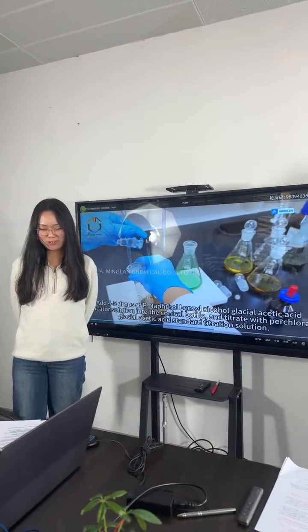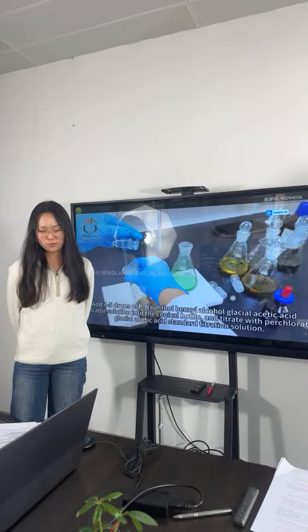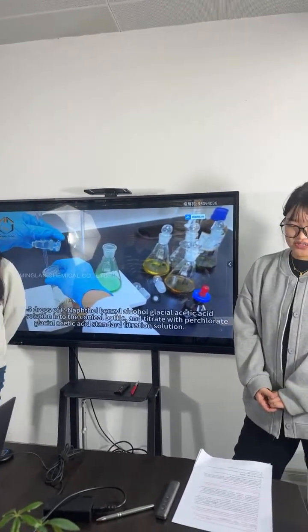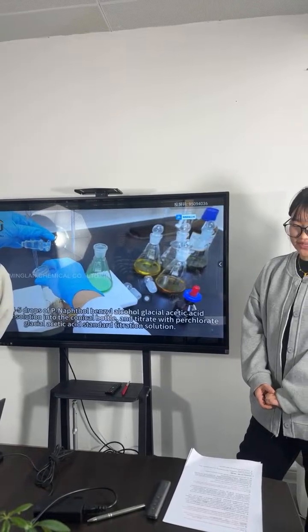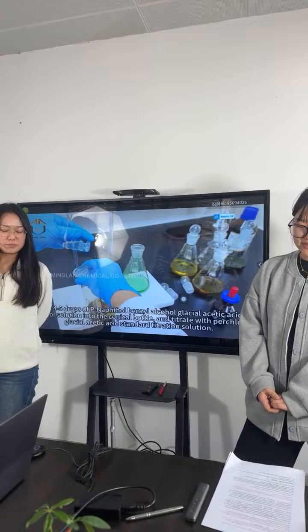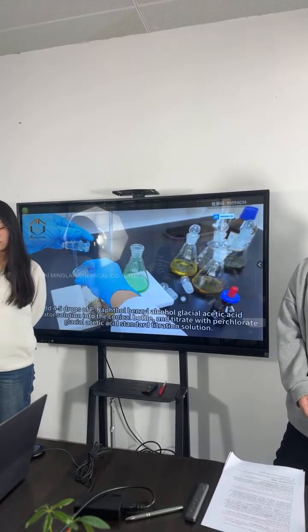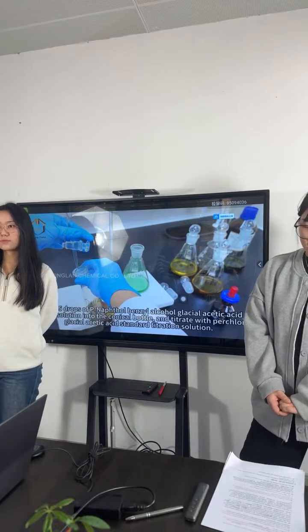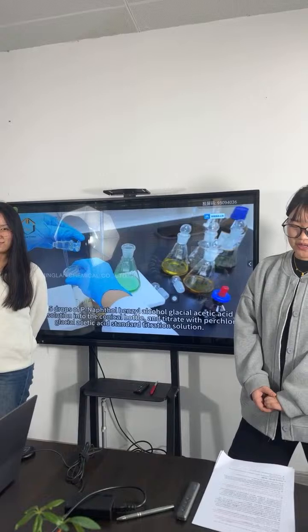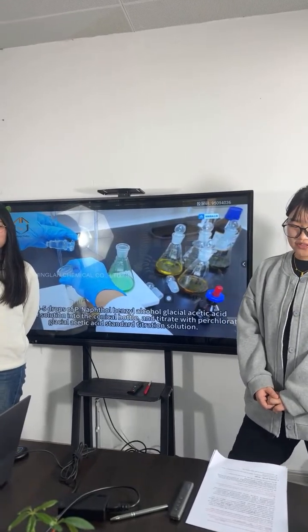Winnie, do you know how to prepare the perchloric acid glacial acetic acid solvent mentioned in this experiment? The titration solvent should be prepared in advance. Mix 500 milliliters of glacial acetic acid and 30 milliliters of acetic anhydride together and add 8.5 milliliters of perchloric acid.